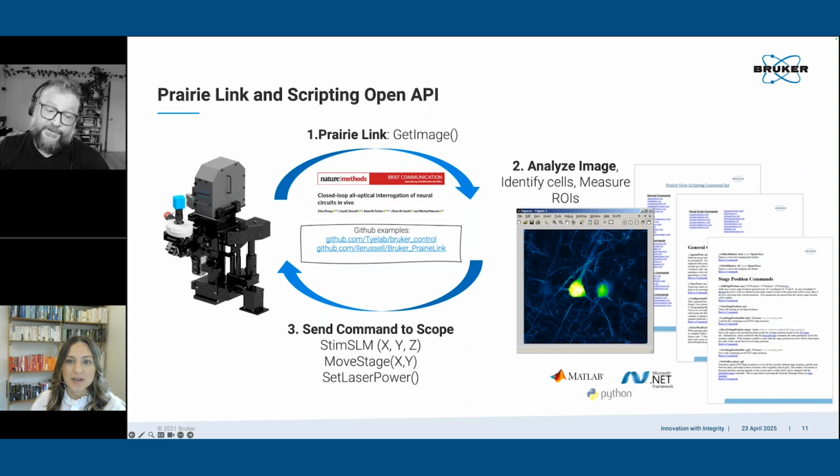Yeah, these are great tips. A lot of ways to handle motion, and it sounds like some of it boils down to acquire more. Make sure you have the data to be able to do the corrections later.